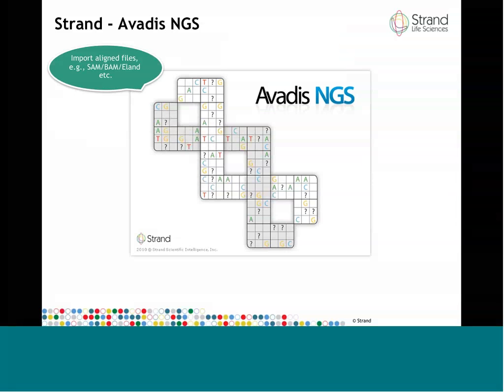In terms of import, Avadis NGS starts with importing aligned files. These are files where you take the raw reads that come out of a sequencer and then align them to the reference genome of interest using one of several alignment tools that are freely available. All of these tools will typically output a SAM or a BAM file, which is a standard alignment format that we import into Avadis NGS.